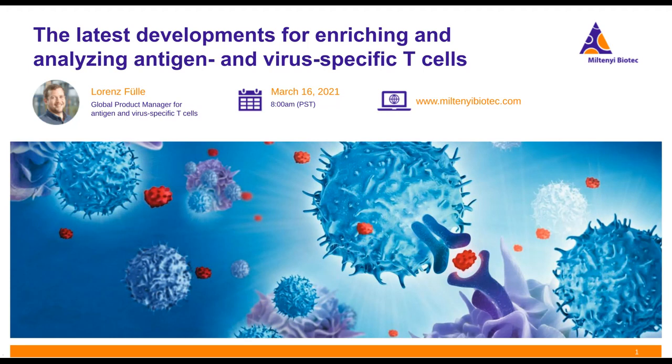Great, thank you. It looks like we have one more question here for you. Do you need to activate APCs for sufficient antigen-specific activation of T cells? Actually not. The protocol that is included in the kit works completely without an additional stimulation of antigen-presenting cells.